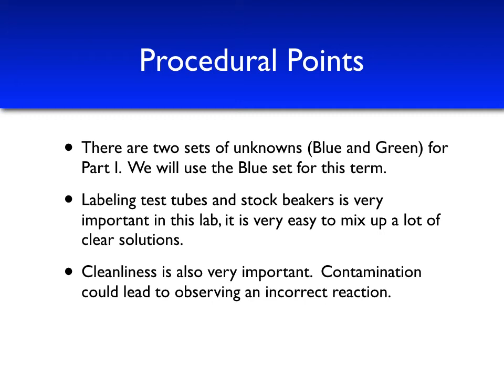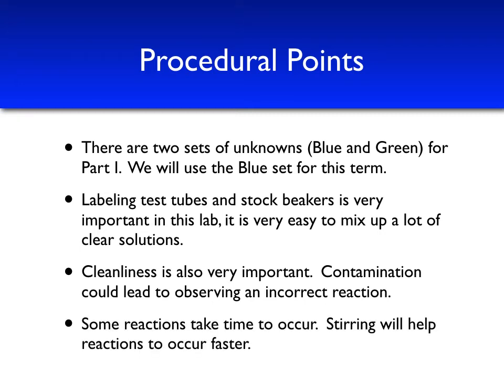Another important point to make is that some reactions take time to occur. It may take a few minutes for bubbling to be observed or for a precipitate to form, or even for the evolution of heat. Stirring does help reactions to occur faster, as we will stir many of the test tubes for this experiment. But it's also important that some observations may take time to occur.